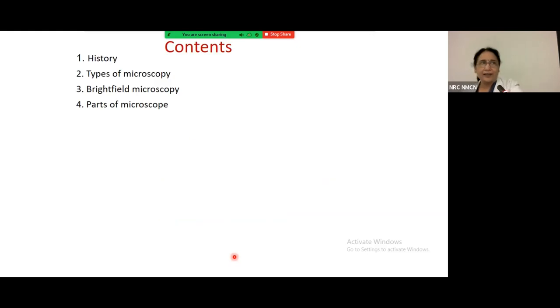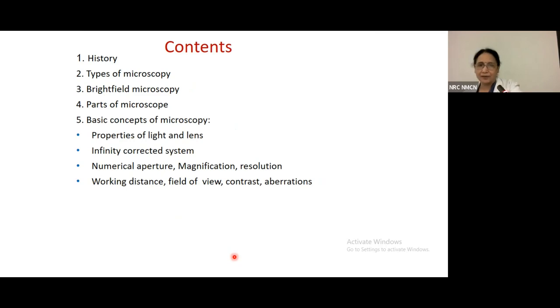I would cover this topic under following heads: history, types of microscopy, bright field microscopy, parts of microscope, some basic concepts of microscopy, like properties of light and lens, infinity corrected system, numerical aperture, magnification, resolution, working distance, field of view, contrast, aberration. I hope the lab people must have heard about these things, but they would be richer after this presentation in knowing what these things are really.